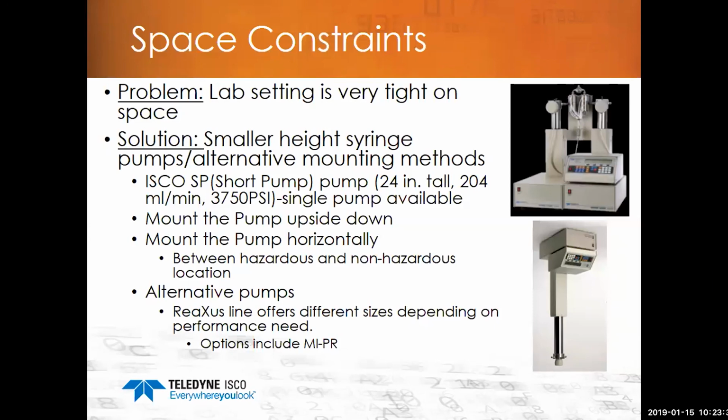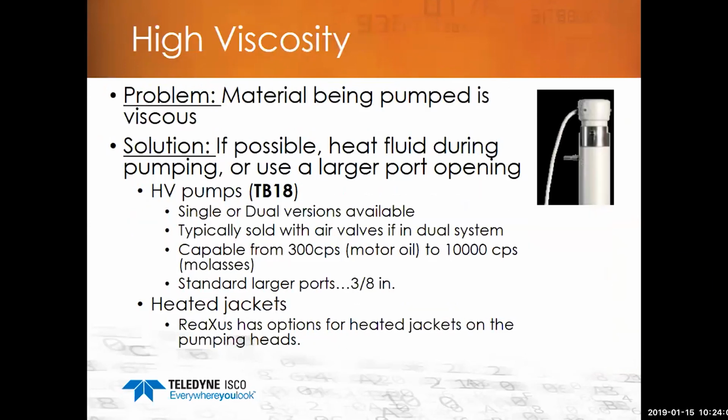And you also want to be able to adjust your application or adjust your positioning in the space itself. Now we have short pumps or smaller types of short pumps available, but you can use your peristaltic pumps, or some of your gear pumps are smaller. So you want to look at that. You can also mount the pump or syringe pumps upside down or horizontally. So sometimes your pumps can function that way.